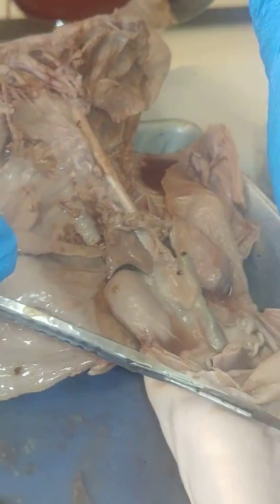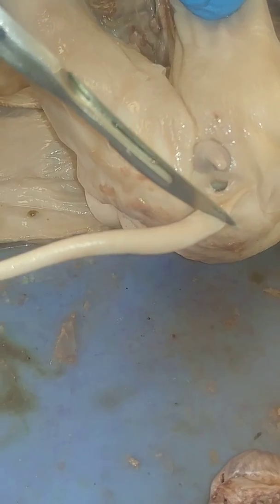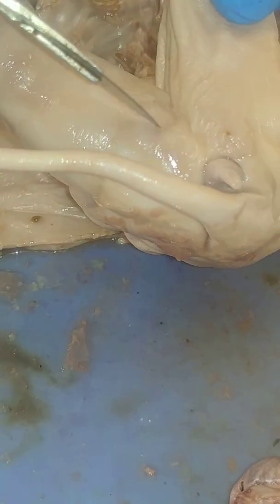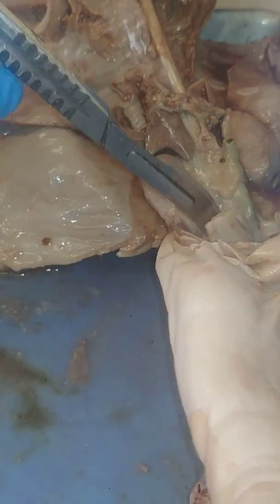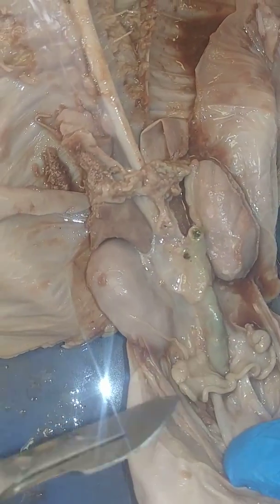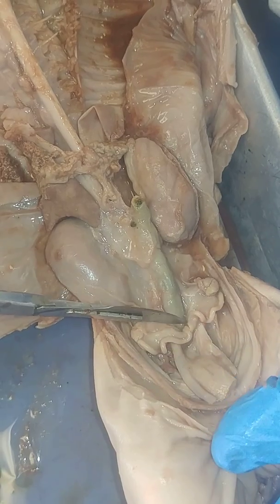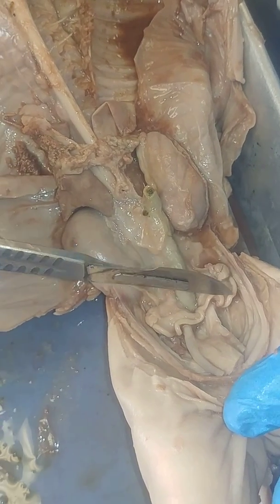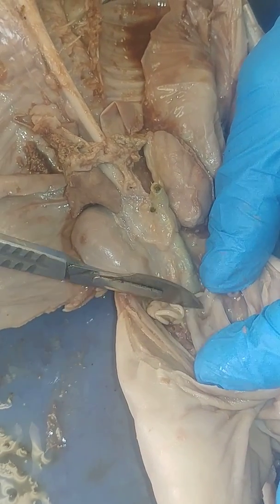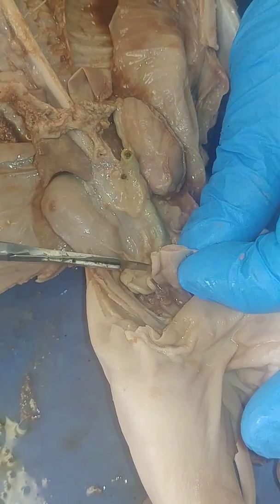Okay, so this animal here is a female. You can tell by underneath the tail. On pigs, it's kind of protruding a little bit. If it was a male, it would have 2 testes hanging down here. So on the inside then, this little bump right here is the right ovary, and this little bump here is the left ovary. These would be the fallopian tubes that carry the eggs from the ovaries down there. And then down below in here would be the uterus. And this is where the umbilical cord hooked on to the pig.